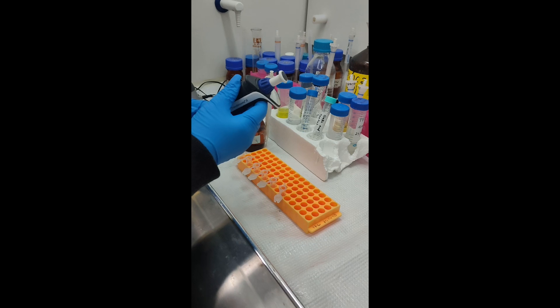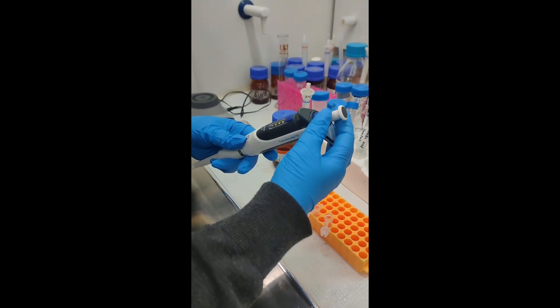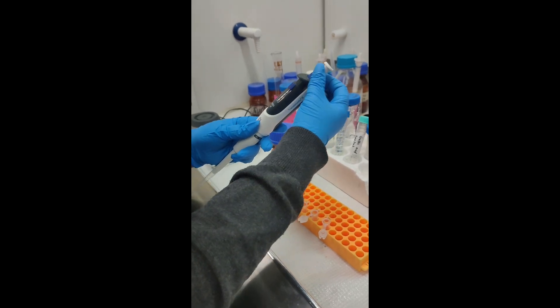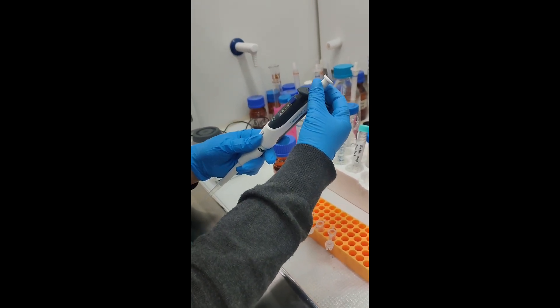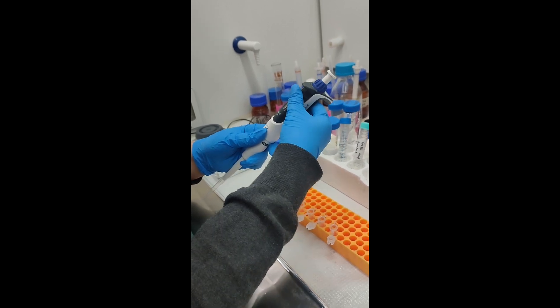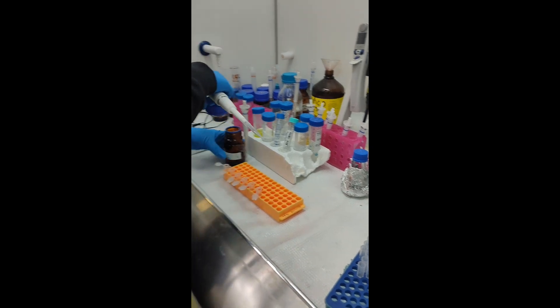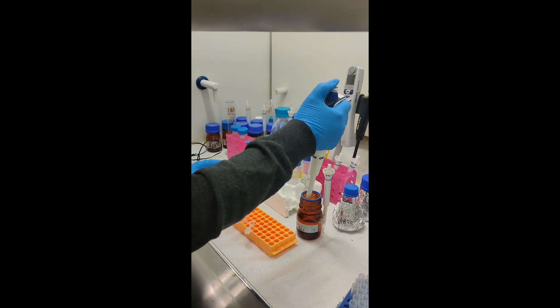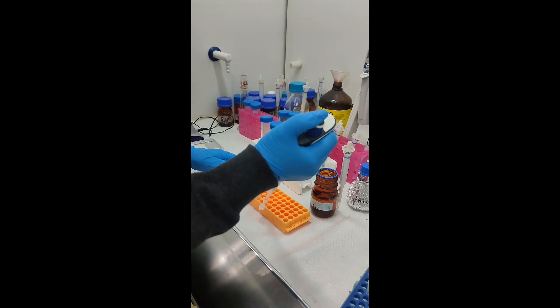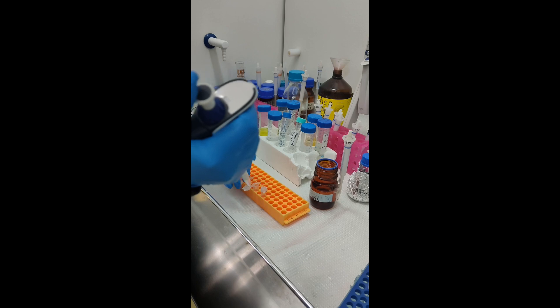This is ethanol 80%, and this is 750 microliters. This is the blank — the last one.